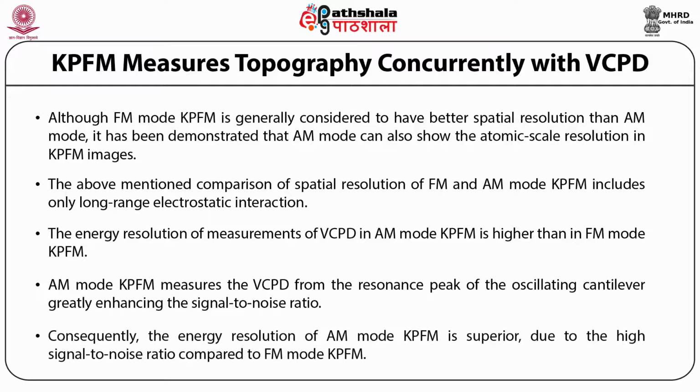Consequently, the energy resolution of AM mode KPFM is superior due to the high signal to noise ratio compared to the FM mode KPFM. The typical spatial and energy resolution of potential of CPD measurement by FM and AM mode KPFM are there as far as the work on these parameters is concerned.